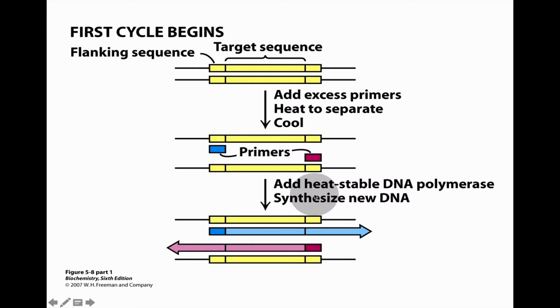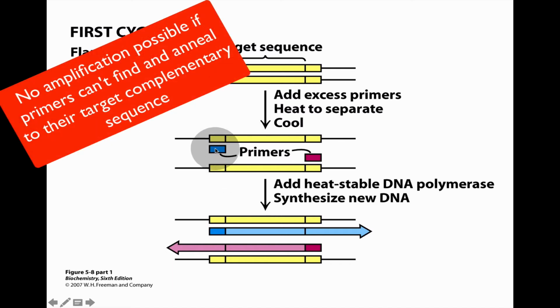And then when the Taq polymerase is present, we will extend these primers on the 3' end and amplify the product. We'll be able to detect that product when it's at higher numbers, and then we know the bacteria was present. Whereas if the bacteria is not present, the primers have nothing to bind to. They cannot find the target region, the bacterial DNA. The primers don't anneal, and that way we have no extension and no product detected.